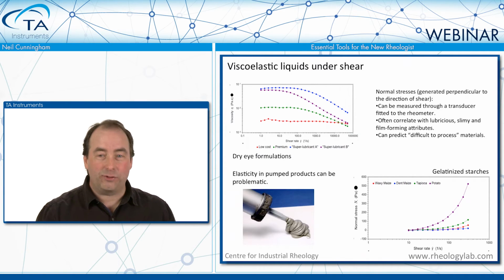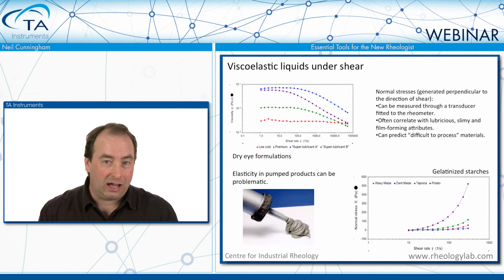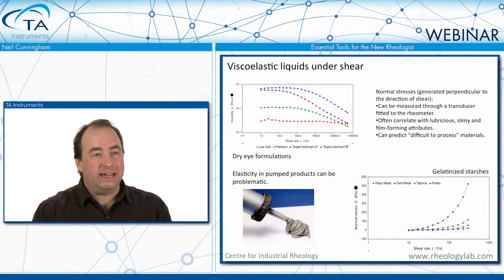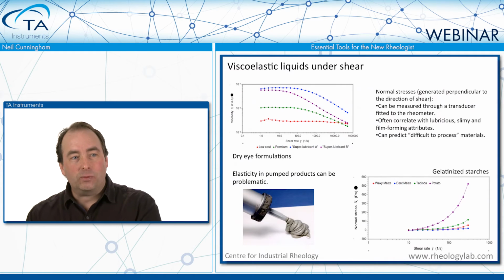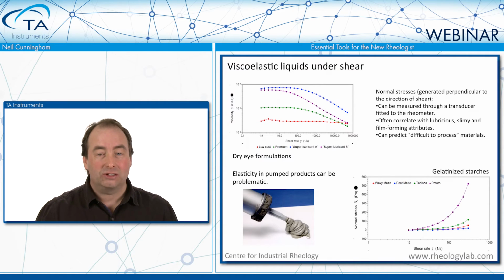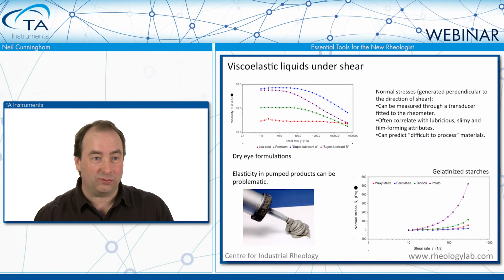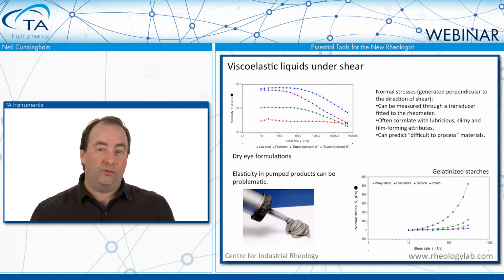Blink shear rates of various values have been reported, but typically anywhere between about 4,000 and 28,000 reciprocal seconds, I think, have been reported for that. And what we can see there is that certainly the purple line, the super lubricant B as I've labelled it, has a combination of a high zero shear viscosity and then it shears down to a low high shear viscosity. This is the ideal behaviour for one of these formulations. Okay, so that's viscosity profiling of viscoelastic liquids.